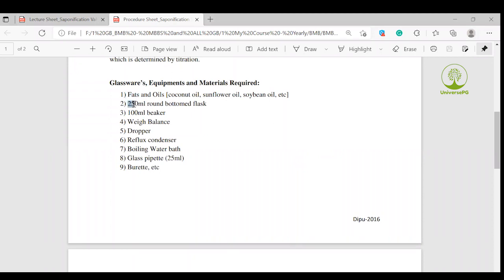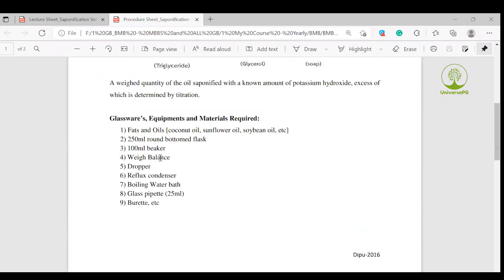For equipment, we used a 250 ml round bottom flask, a conical flask, a cork, a 100 ml measuring vessel, a weigh balance, a dropper, a reflux condenser, a boiling water bath, a glass pipette, and a burette.